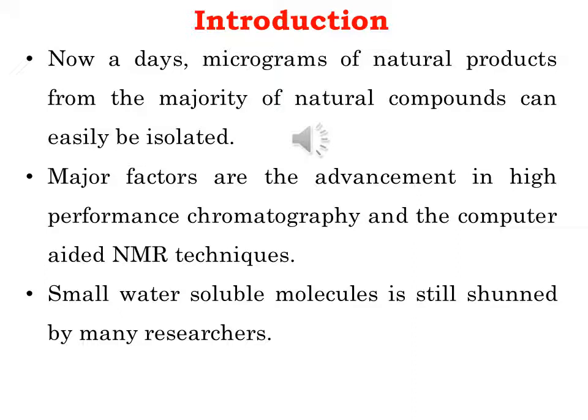Despite all this, the purification of small water-soluble molecules is still shunned by most researchers. For example, a glance at the natural products section of Chemical Abstracts shows that about 95% of new substances reported are in the lipid-soluble category. There may be more lipid-soluble compounds than water-soluble compounds in nature, but the ratio seems to be greatly disproportionate. Clearly, this reflects the difficulty in purifying small molecular weight water-soluble compounds.